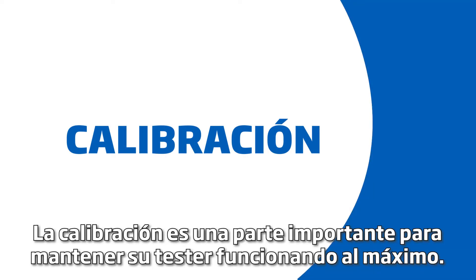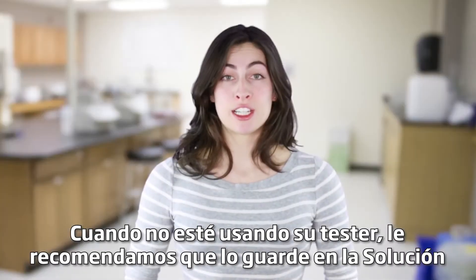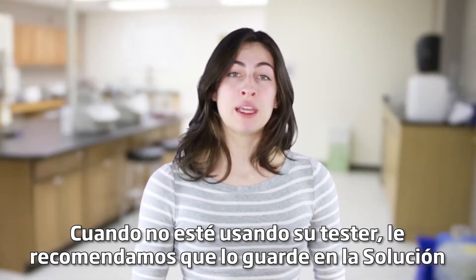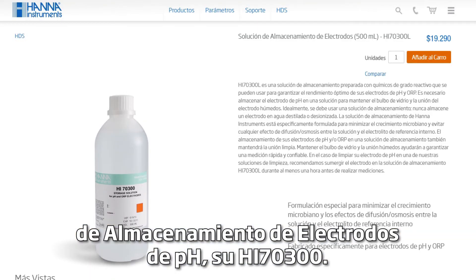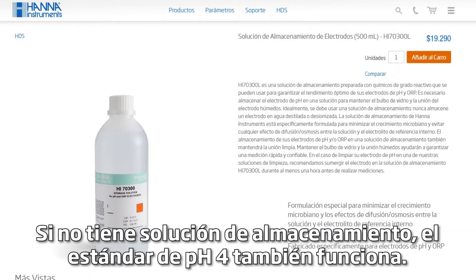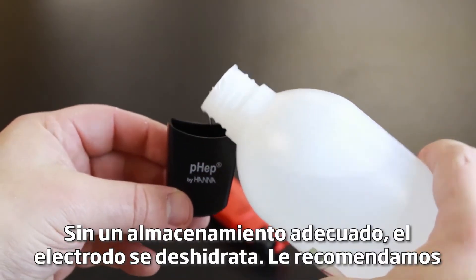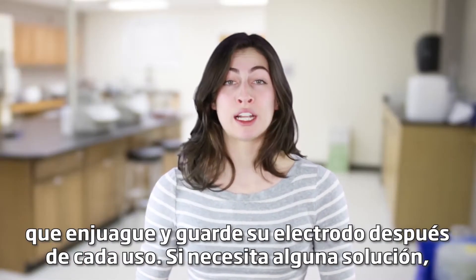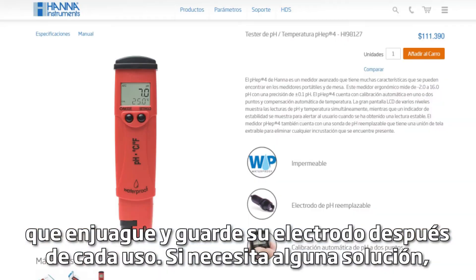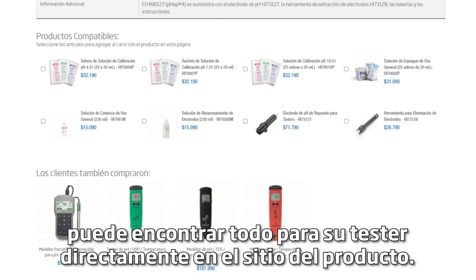Calibration is an important part of keeping your tester operating at its best. We recommend calibrating before each use. When you're not using your tester, we recommend you keep it in pH electrode storage solution, your HI70300. If you don't have storage solution, pH 4 buffer works too. Without proper storage, the electrode gets dehydrated. We recommend you rinse and store your electrode after each use. If you need any solutions, you can find everything for your tester right on the product site.